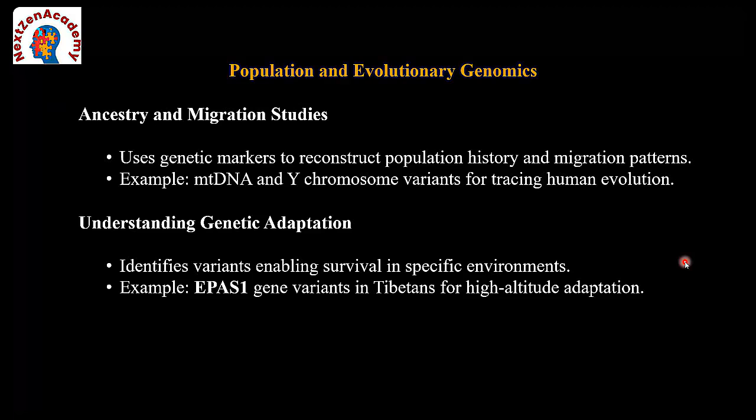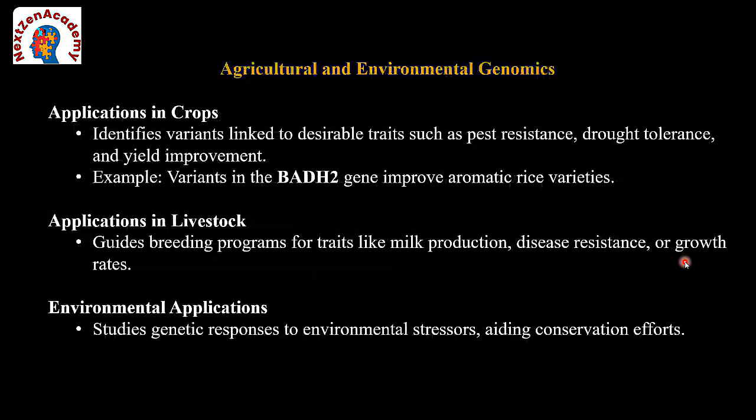How significant is it? We take indels, which are insertions or deletions. SVs are structural variants. SNVs are single nucleotide variants, and copy number changes significantly affect different areas. That is what you had here.